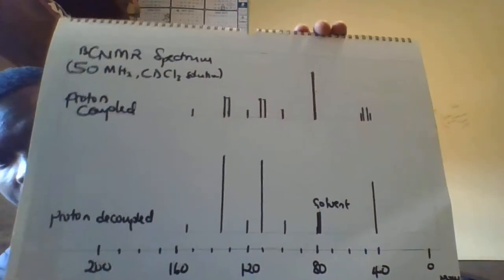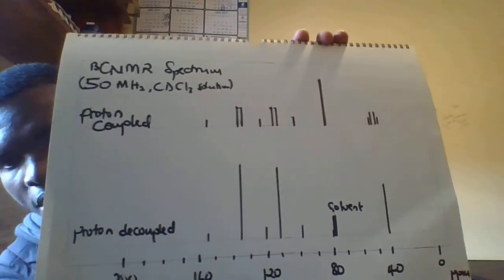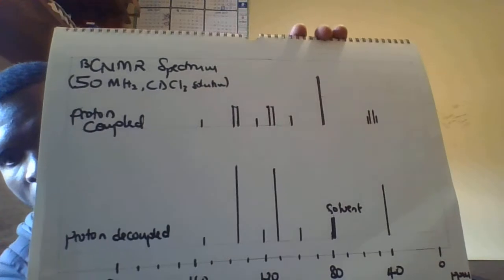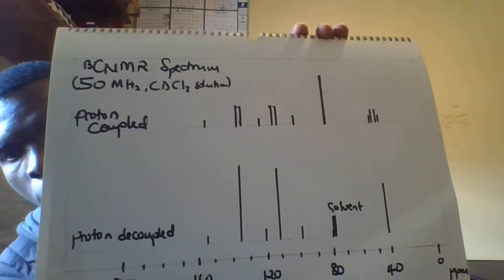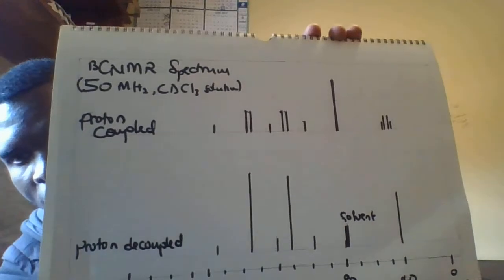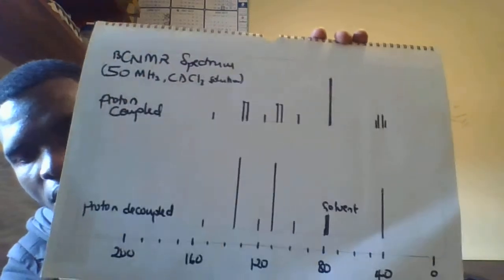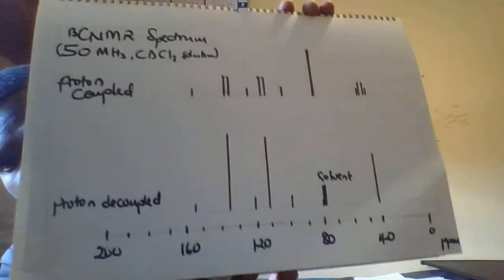It's something interesting because, as you can see, we have 9 carbons in our molecule, but we are seeing 6 peaks. So already it shows us that there is some degree of equivalence. There are some carbons that are sharing the peaks in the spectrum. Equivalent carbons produce 1 peak. So we do have 3 pairs of carbons here, so we shall see which carbons are equivalent in our structure. This is the information that we need to figure out.